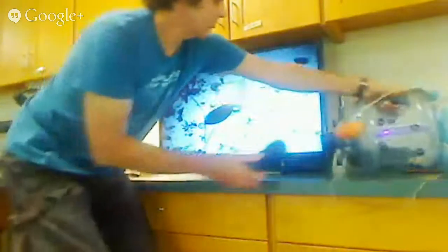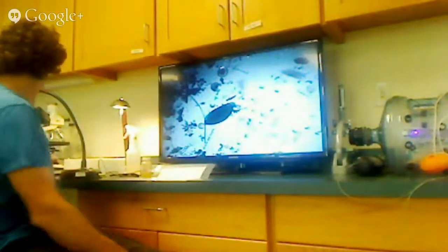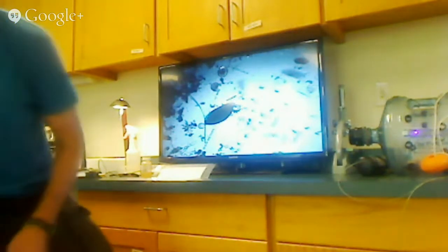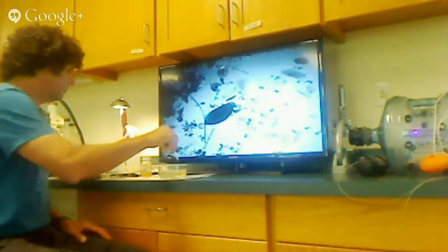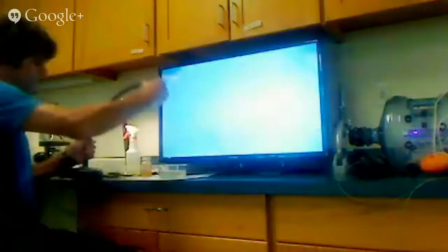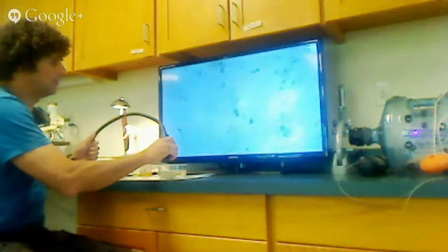So what does the sample look like when we collect it? It ends up looking like this. And I'm going to move my video cam here from the microscope over to our sample and focus it for you.